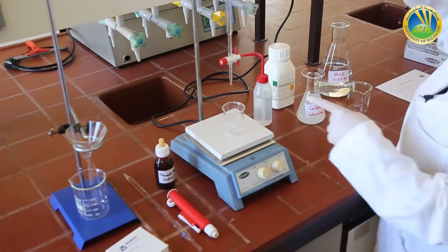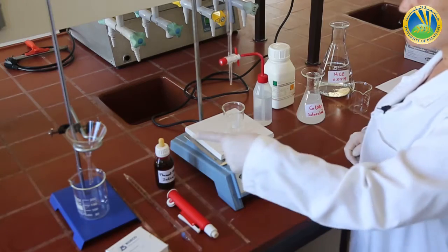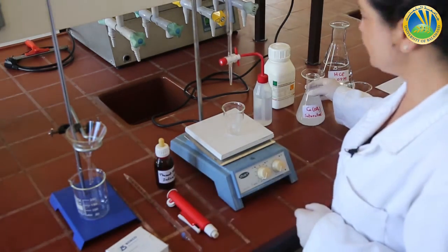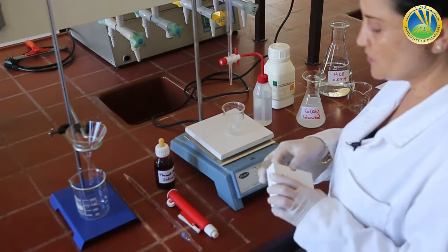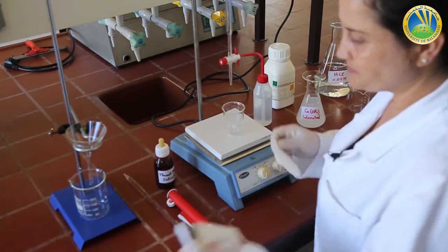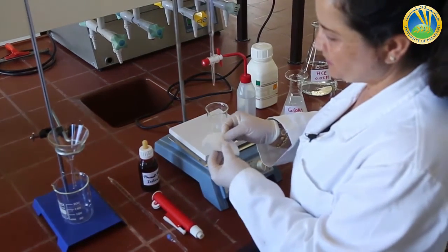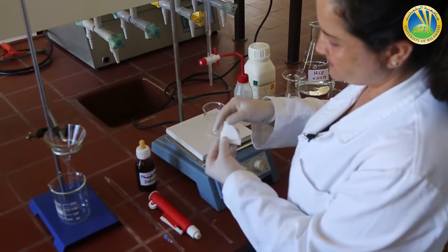I am going to use phenolphthalein as an indicator, and I will start by filtering the saturated solution of calcium hydroxide. To filter the solution, I will use a filter paper — this is a filter paper. I want to show you how to fold a filter paper to do a correct filtration.